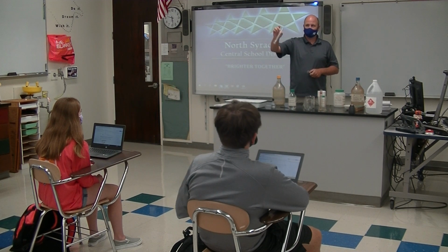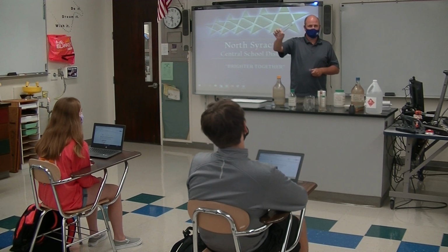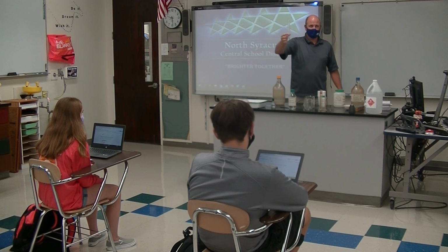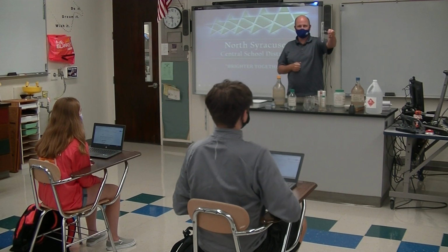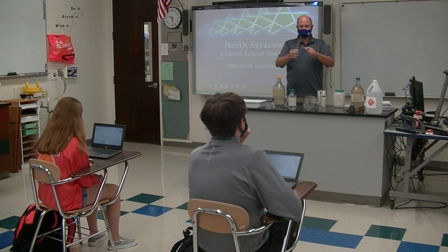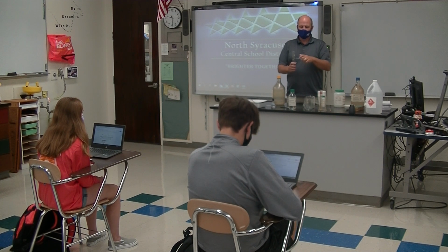Do we know what this is? It's kind of a big one. Have you ever seen one of these before? This is called a test tube. Do you know what this thing that's holding the test tube is called? Test tube holder. You hold a test tube holder by the little circle at the end. If you hold it here, the test tube can fall out. So you carry it like this in a test tube holder.